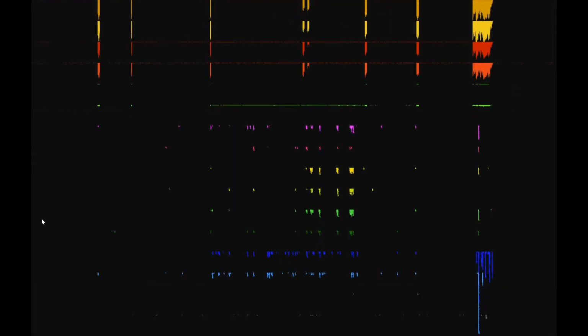Now let's test other interactive features of the browser using another experimental dataset. Here we compare gene activity in 2 populations of neurons, normal cells and neurons lacking an important regulator linked to autism and epilepsy, called RB-FOX. We zoomed into a gene important for transmitting nerve signals, which is active and fully functional, but not in developing neurons, as can be seen here.